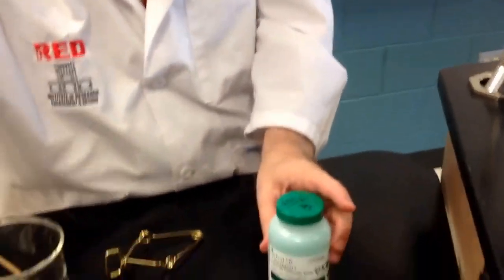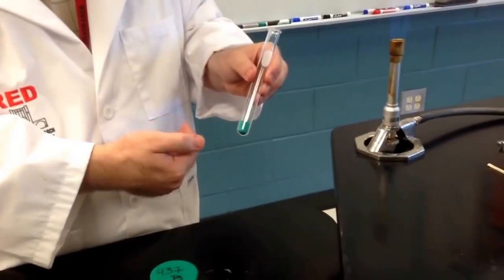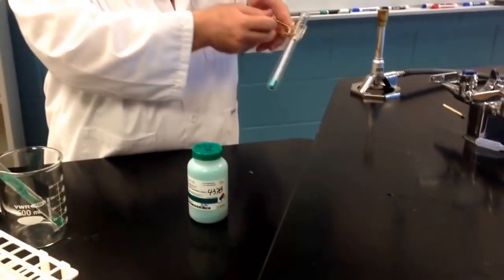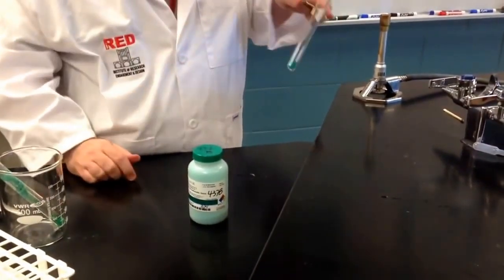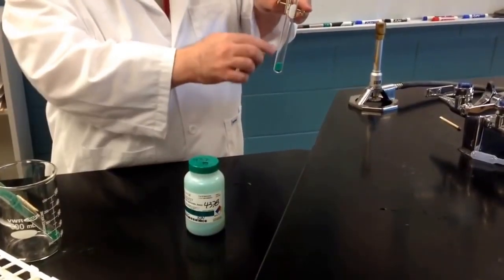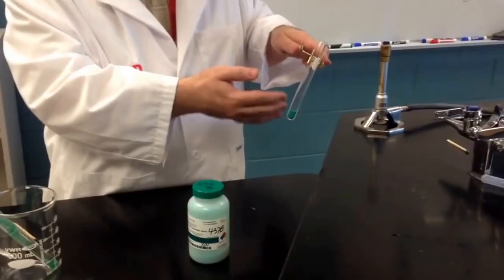We're going to take a test tube with about a scoop full of copper 2 carbonate. We're going to heat it evenly over a blue flame, holding the test tube away from yourself and away from others. And as it heats up, it will begin to bubble, and you'll see the powder bubbling a little bit.